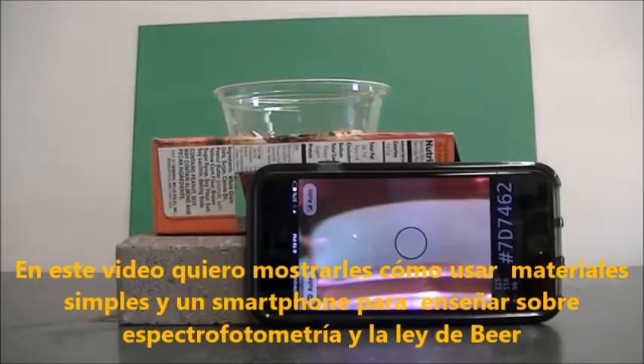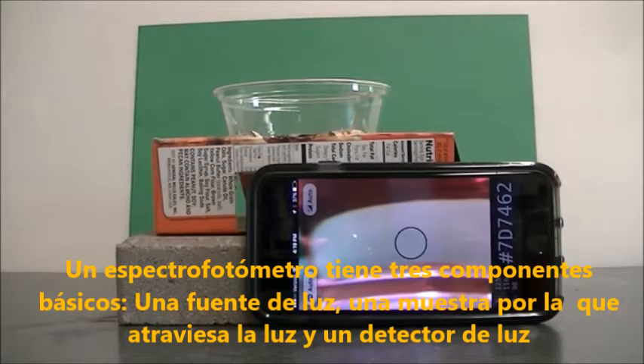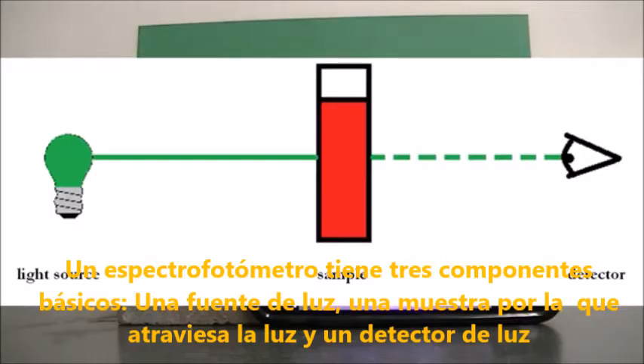In this video I'd like to show you how you can use simple materials and a smartphone to teach about spectrophotometry and Beer's Law. A spectrophotometer has three basic components: a light source, a sample through which the light passes, and a light detector.